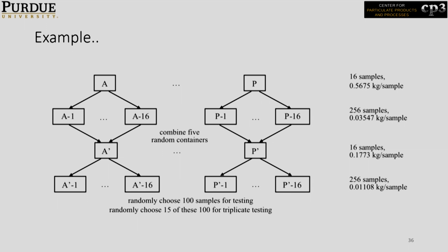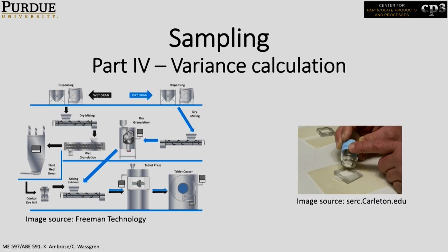Again, I'm not going into the study, but what they did was collect lots of samples and subsamples and mix them together, then collect and repeat that multiple times, to find an appropriate sampling procedure to minimize the errors, or a sampling procedure with low standard deviation. Okay. So again, I'll not go into the detail, but it's freely available on the web. You can just Google and see those details. Yeah.